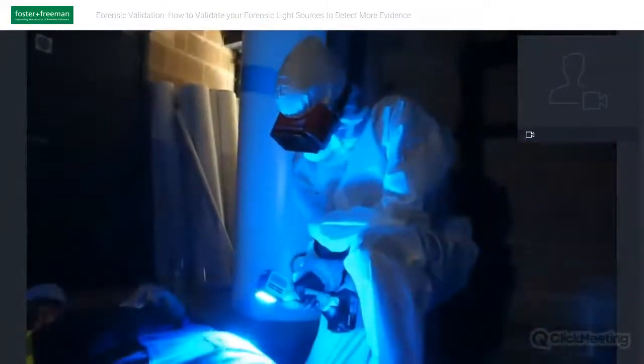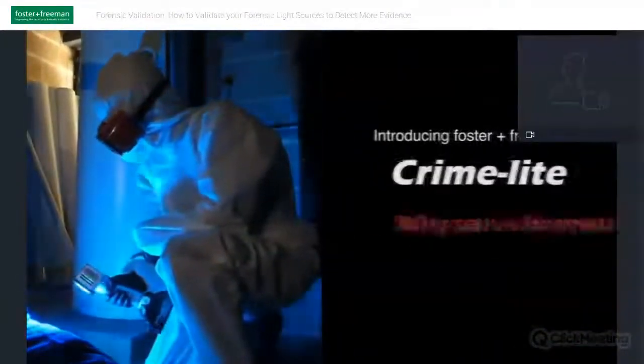So throughout the webinar, we'll also be looking at the validation process for forensic light sources and how it's really important that CSIs and labs create a robust quality assurance process that ensures that light sources are always being used to their full potential. Why use a forensic light source?